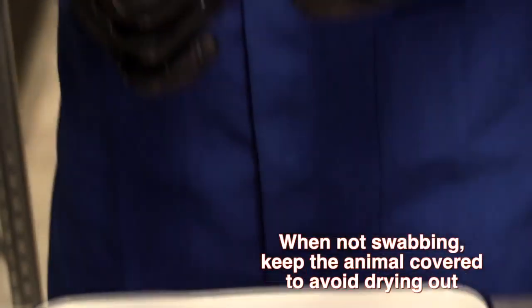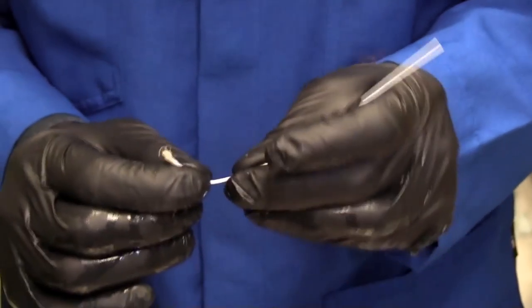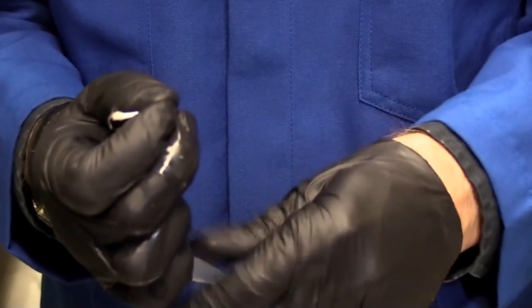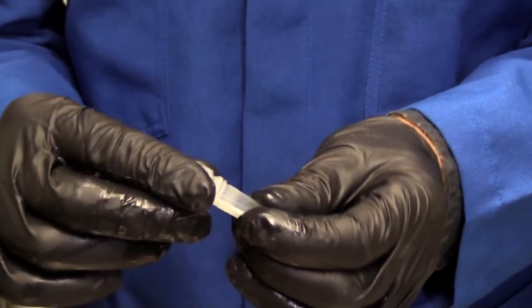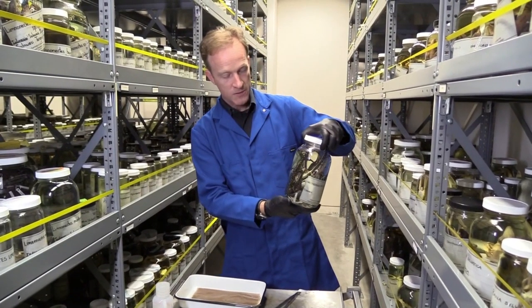Notice I've covered it up so it doesn't dry out. We're looking to see whether any of these animals that were collected years ago may have been infected with a fungal pathogen. We can now extract the DNA from that and see if our pathogen is actually on this animal.